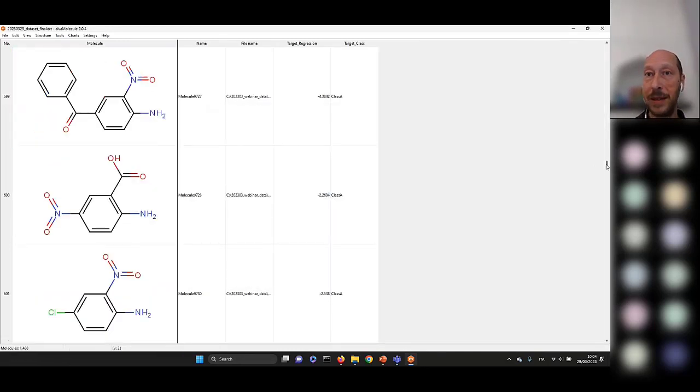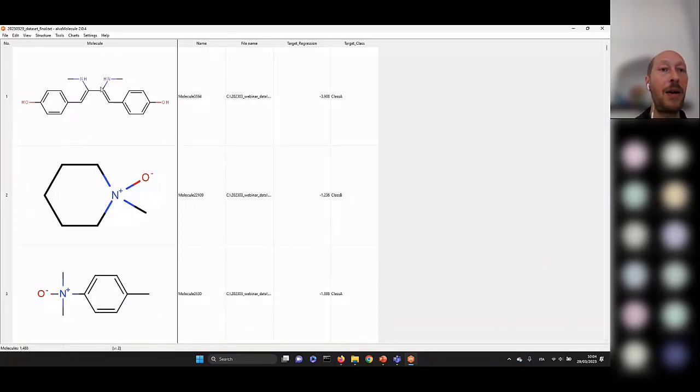So we can see that, for example, these are our molecules that before had unusual valences. We can see that 2 hydrogens have been added to the nitrogen of this molecule, reaching the usual valence. We can see that these atoms have unusual valence now. And we can also see that these two molecules have been changed using the custom standardizers that we introduced in the standardizers options.